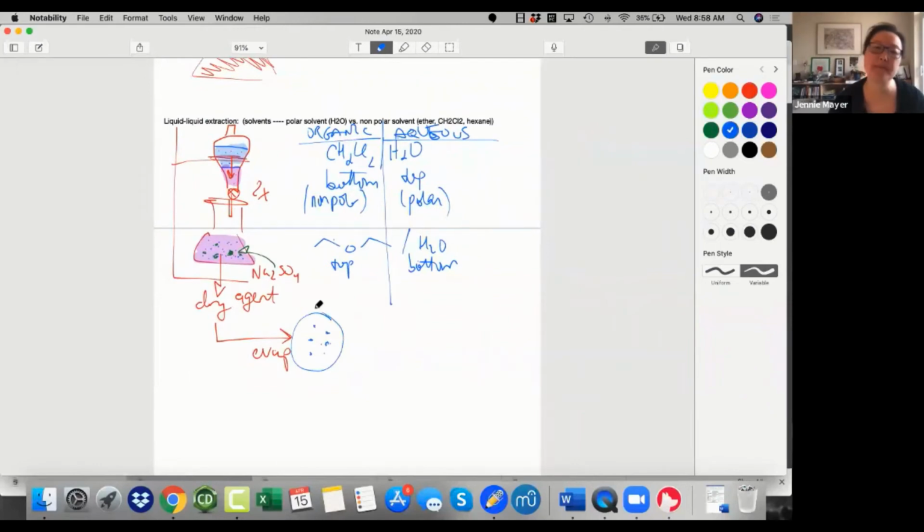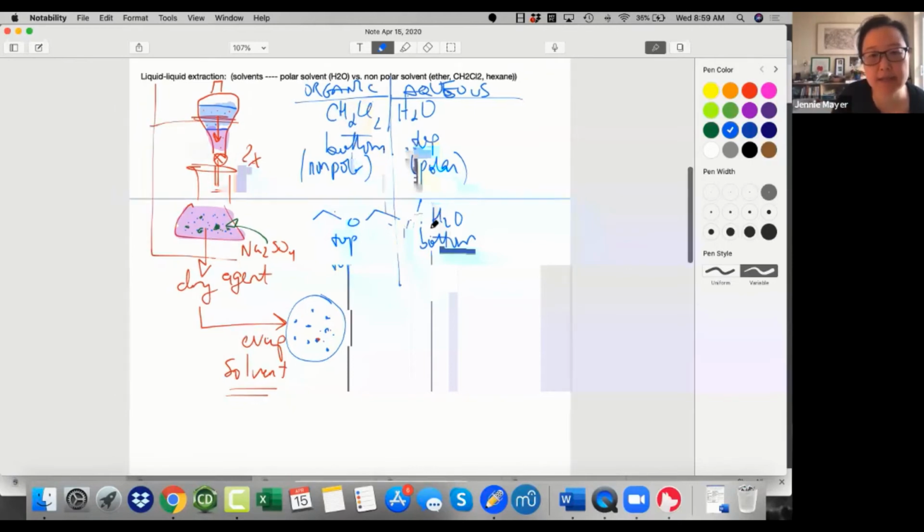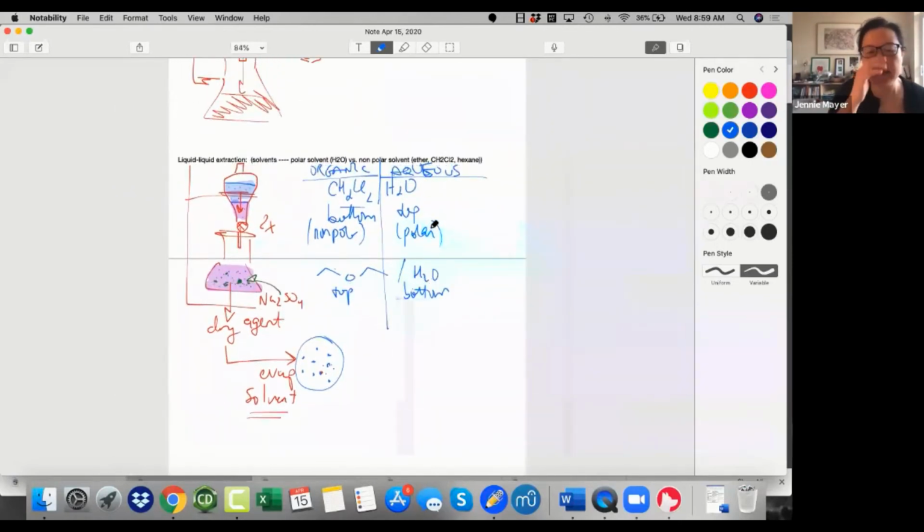Okay, so evaporate the solvent. And so of course most solids don't easily evaporate anyway, right? They usually melt and then you can evaporate them. But just in case, these are not very volatile, right? So these are solid crystals. Okay, so otherwise we'd be in trouble when we evaporate. Okay, so the solvent is easily evaporated. Usually we pick solvents like these, which tend to evaporate at approximately 35 degrees Celsius. So, okay, that's the basic idea.